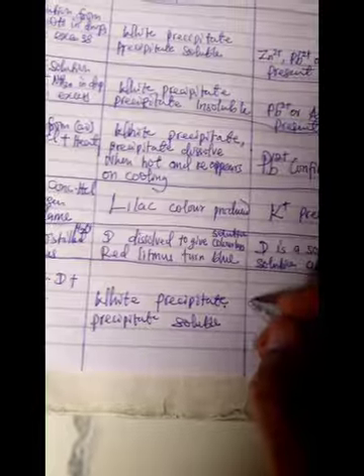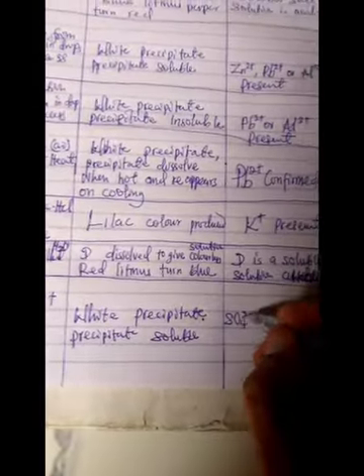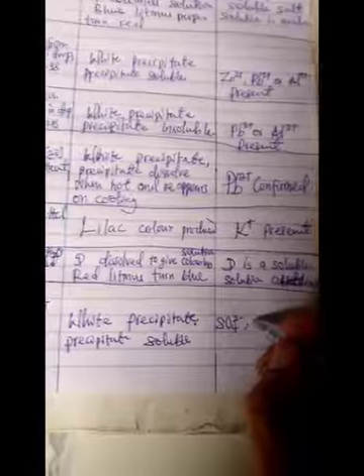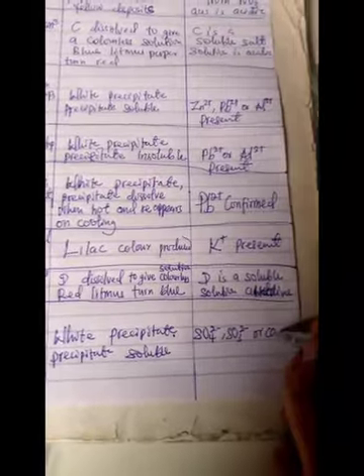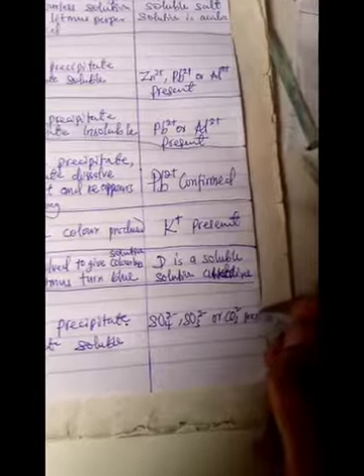With barium chloride giving a white precipitate, there are 3 ions there: SO4 2-, SO3 2-, or CO3 2- present. Then with HCl, it dissolved.